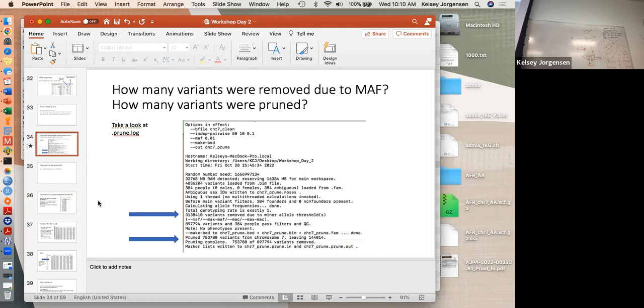I think for some reason, just one version doesn't have that command. Oh wait. So I think it might have to be something troubleshooting with it, right? For now, I'll upload the next step files on the Google Drive, okay? So you can follow along.